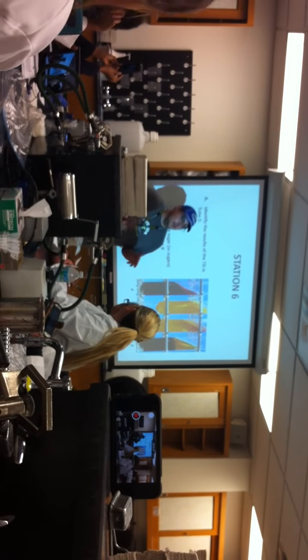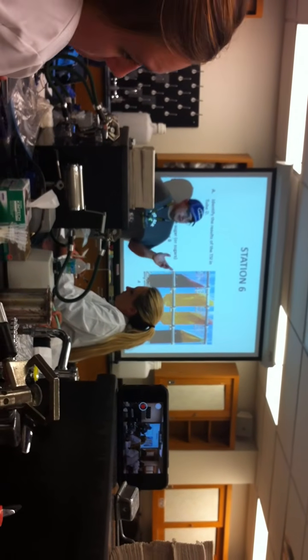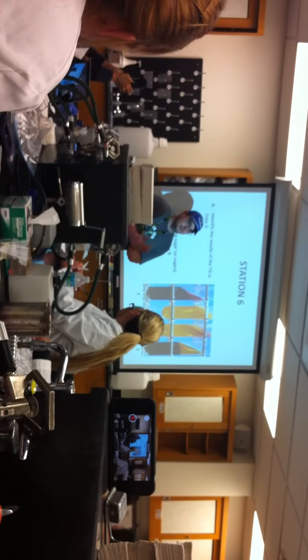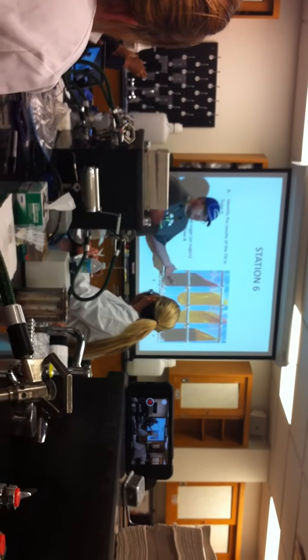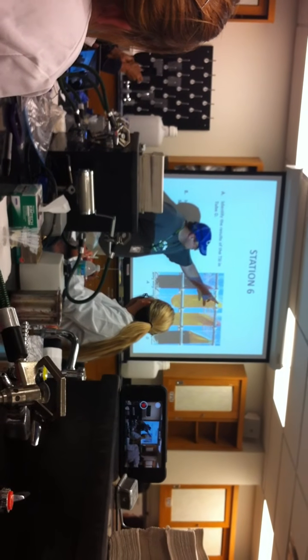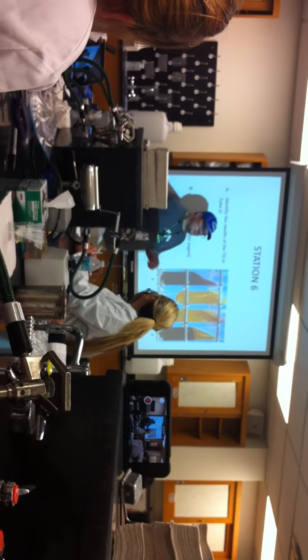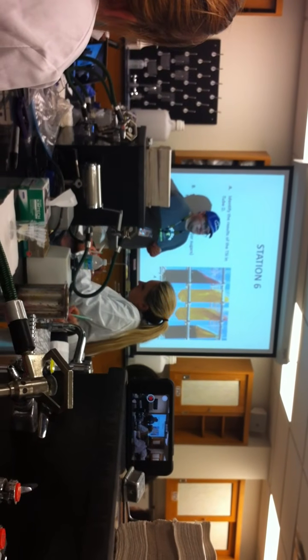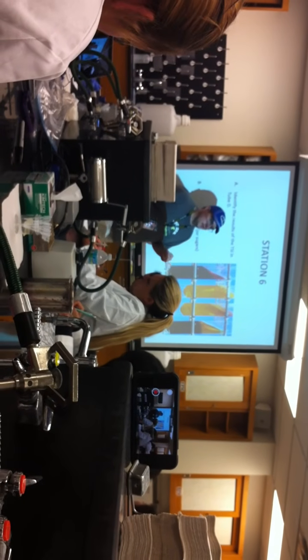K over K, gas, or the plus and minuses. Actually, since we did not do that in lab here, all I want you to do is be able to read this. So, for me, if we had a test question like this, if you told me fermentation over fermentation, and then you said gas production, that would be right. Okay? I am making it easy for you. You do not need to know the lettering scheme.